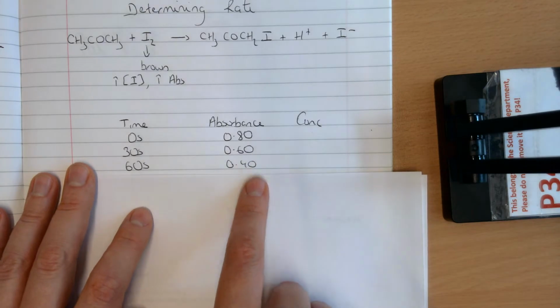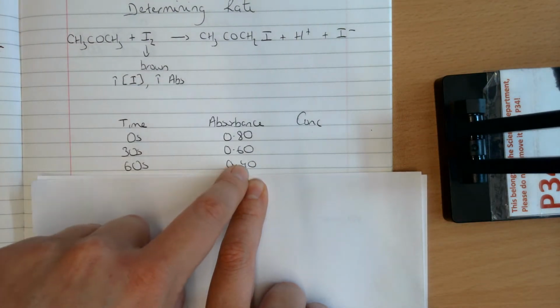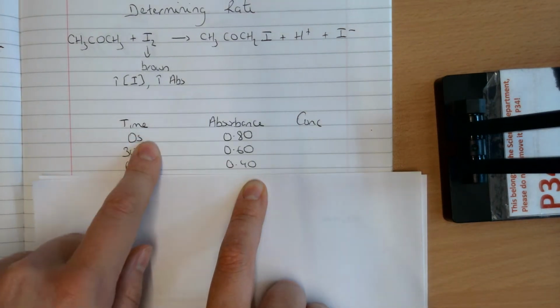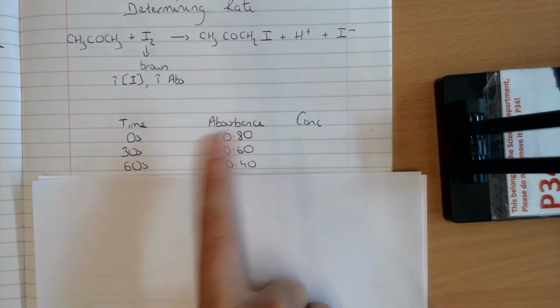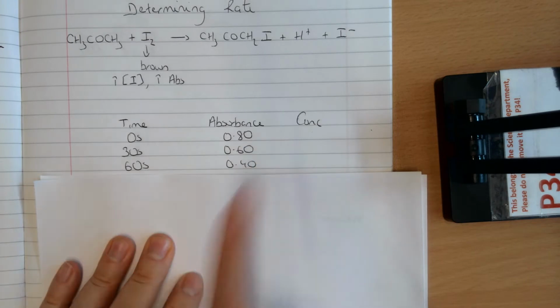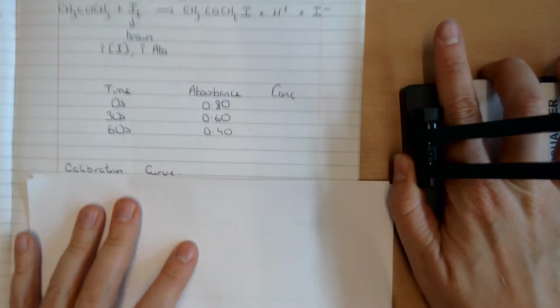And then another 30 seconds later, I take a sample from the reaction, I run it through my colorimeter, and I see my absorbance is decreasing again. I'm able then to plot this little table. I've got time and I've got absorbance. But what I really care about when I'm looking at rate is I want to know how the concentration changes over time. At the moment, I've only got absorbance. I need to relate that absorbance to concentration. And in order to do that, I'm going to need to plot what is called a calibration curve.